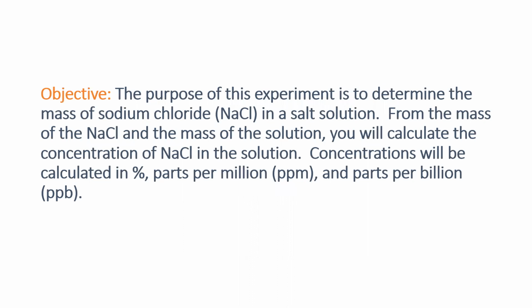The objective of this experiment is to determine the mass of sodium chloride, or salt, in a salt solution. From the mass of the sodium chloride and the mass of the solution, you will be able to calculate the concentration of sodium chloride in the solution. Concentrations will be calculated in percent, parts per million, and parts per billion.